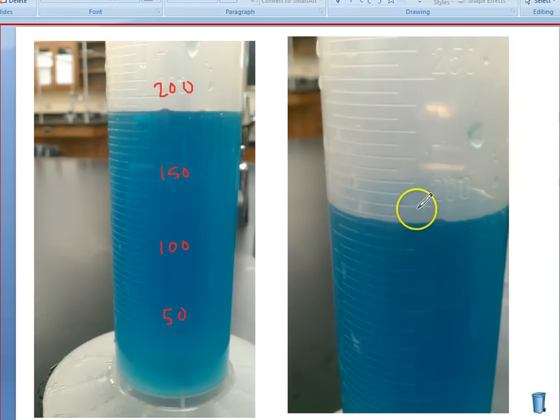Here I'm going to look at this zoomed in part because it's easier for me to see each individual line. Okay, I've got 1, 2, 3, 4, 5, 6, 7, 8, 9 lines between 150 and 200. That makes me think that each of these bigger lines is maybe 10 and each of these smaller lines is 5. So let's see if that works.